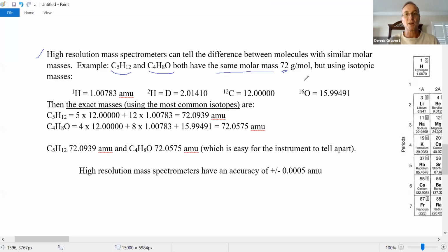It's equal to 72 grams per mole. So using the averages, that's what we get. Average atomic masses over here. Sorry, average atomic masses. I don't know why I circled sodium. There's no sodium here. But using the periodic table, you calculate the molar mass. You know how to do that. And with two sig figs, both chemical formulas are 72.